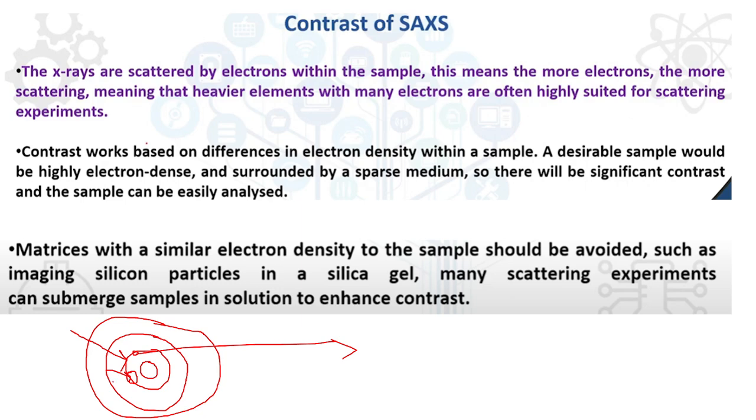Is it okay? Now, the main thing is that it must have a higher effective or higher nuclear charge. As a heavy atom, obviously, because the number of protons is higher in the nucleus, it must have higher binding energy, na? The higher the number of protons, obviously, because of higher electrostatic interaction, it will have higher binding energy. So the higher the energy, there will be a higher chance to release the excess energy through X-ray. That's why we need a heavy atom.